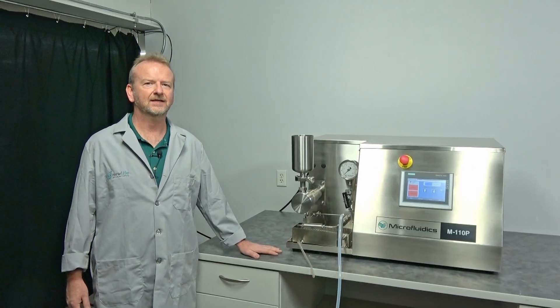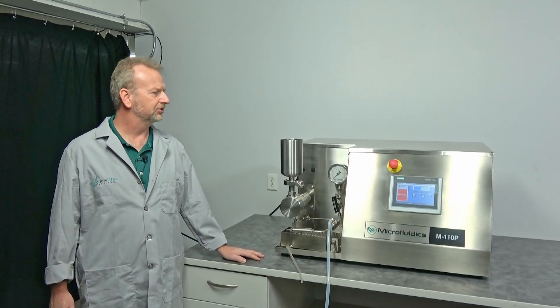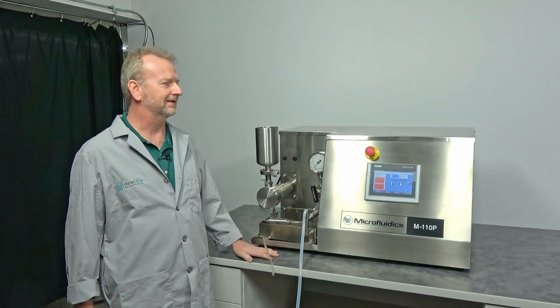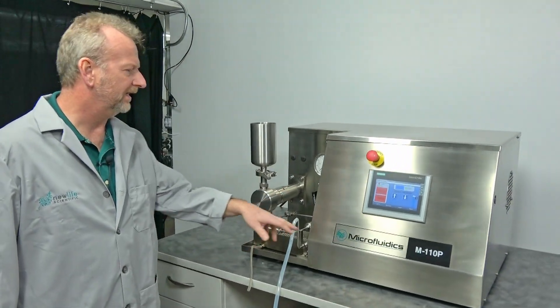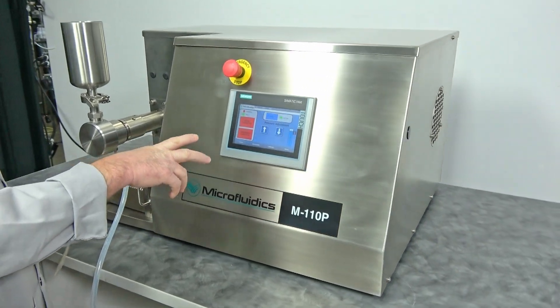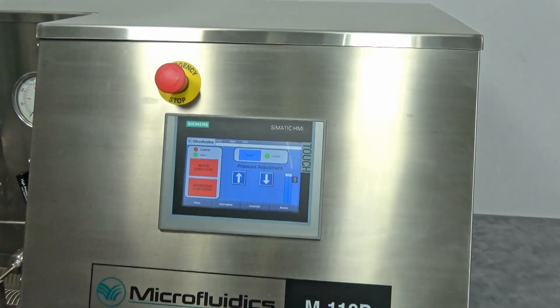Hi, I'm Rich at New Life Scientific, and today I want to show off this beautiful, almost like-new machine. The reason I say that is because it only has six hours on it. This is a 2019 Microfluidics M110P — the newest generation with the touchscreen — and this is the 30,000 PSI machine.